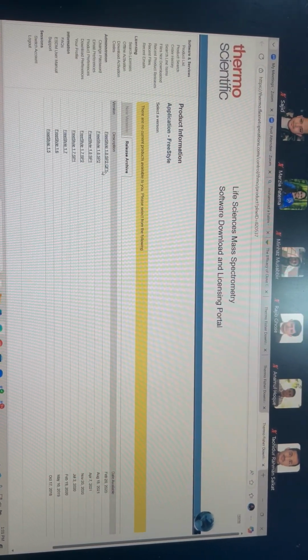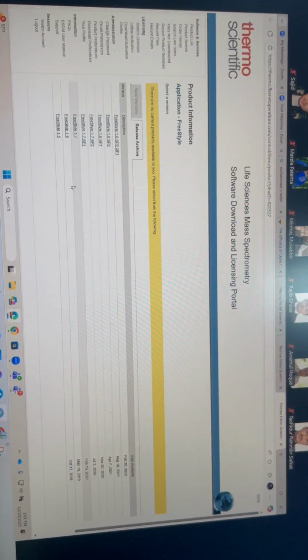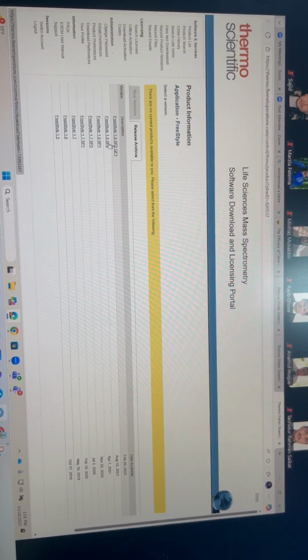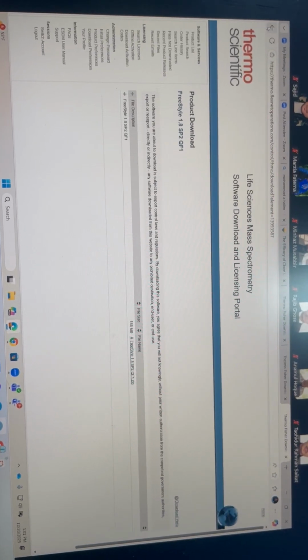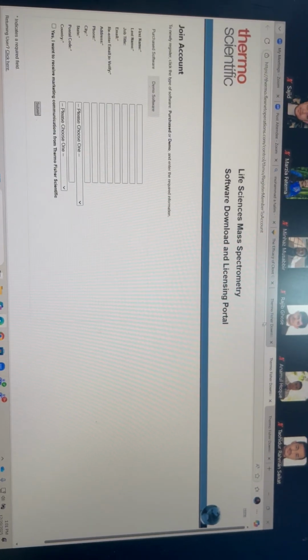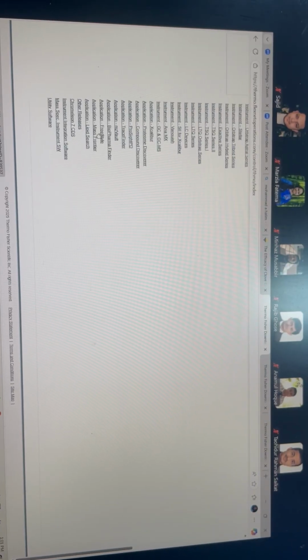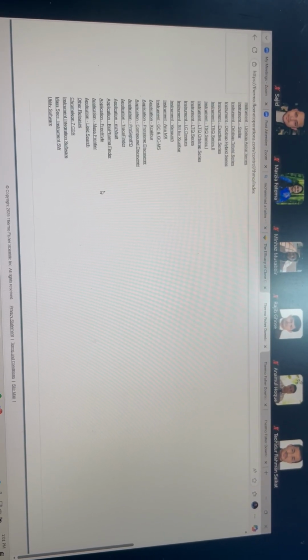So are they compatible with Linux? Maybe not. So if you go there, these are mostly all Windows software. Okay, may not be applicable. Okay, so as I mentioned, that's Freestyle. So we'll be using this Freestyle software.